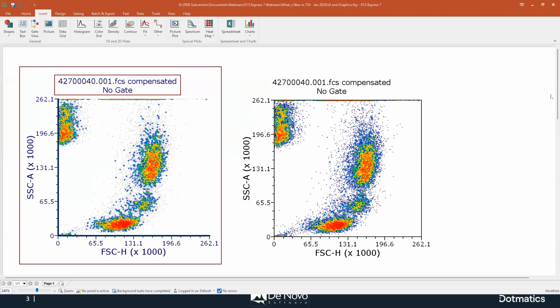We applied those changes based on a bunch of surveys that we ran in 2024 about aesthetic preferences among our users. So you see the colors, font colors and lines are all black now, no more navy blue. There is no border around the plots, no border around the titles. The outlier dot size, if you are using a density plot like in this case, is slightly larger.